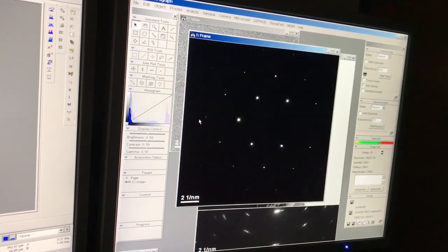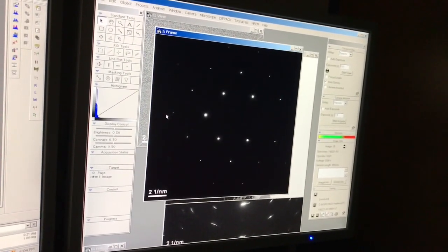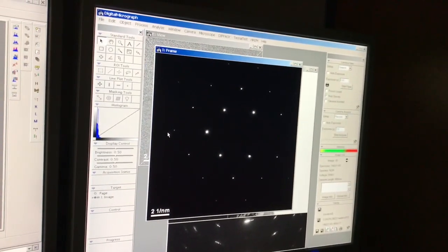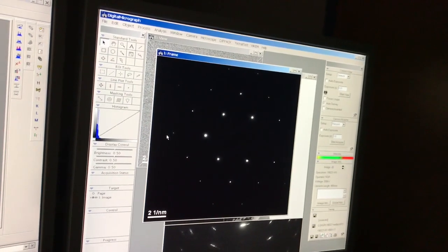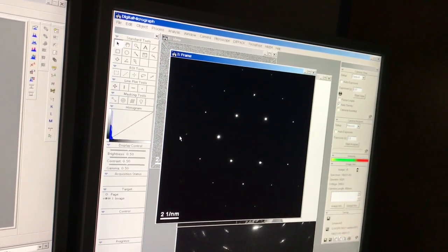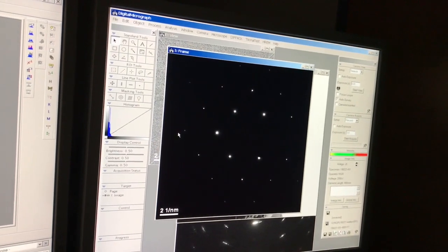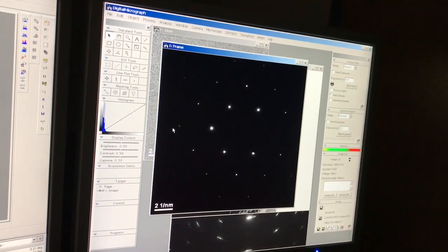Now I already know this because I've done it. It's called rotation calibration. I'm not going to go through how to do it. But what I know for this particular instrument, and your particular instrument may be different, on newer instruments you usually don't have to do this, because usually the engineering now is such that there's no need to perform rotation calibration. This is an older instrument though, and we do have to do it.